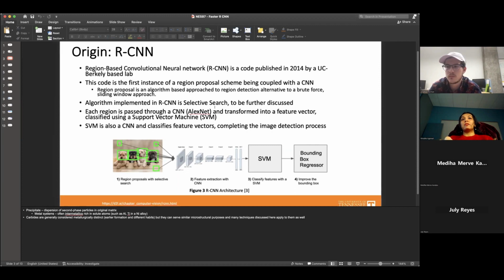One of them is convolutional layers, the other is fully connected layers. With the convolution layer, you are simply extracting features, or creating a low resolution image. Basically you have a matrix of numbers that gets multiplied with your image. But then you're passing it to fully connected layers.